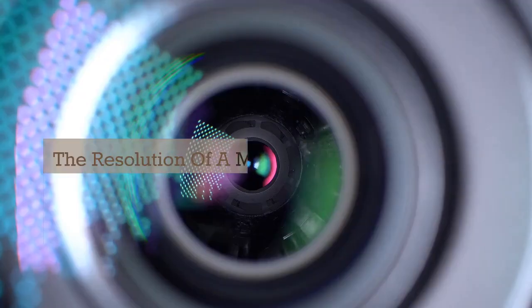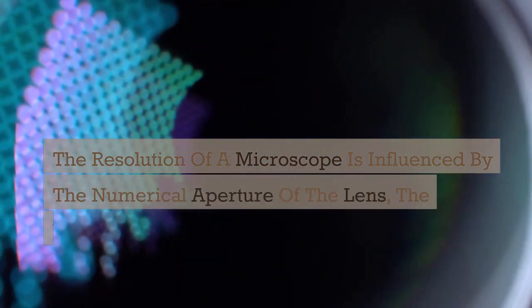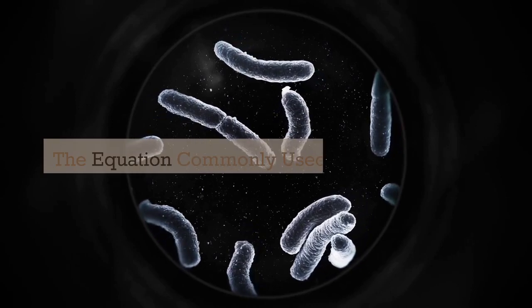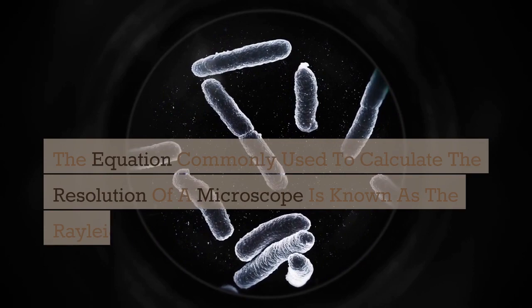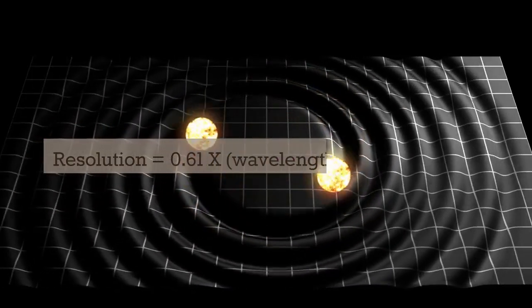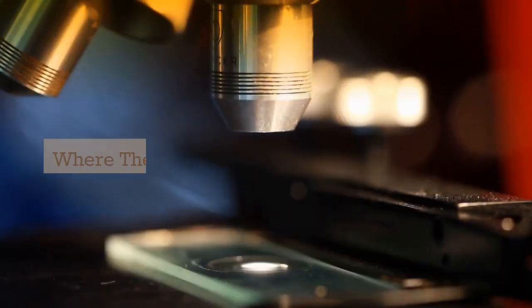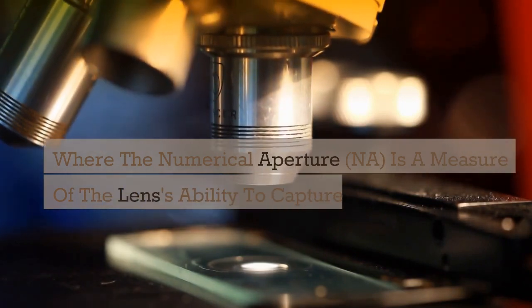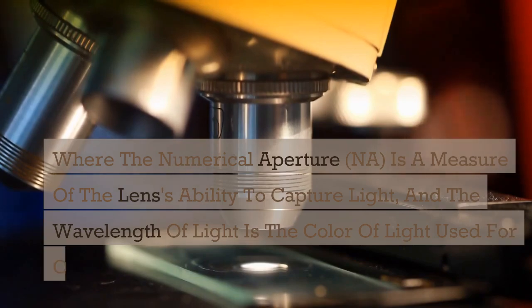The resolution of a microscope is influenced by the numerical aperture of the lens, the wavelength of light used, and other factors. The equation commonly used to calculate the resolution of a microscope is known as the Rayleigh criterion, which is resolution equals 0.61 times wavelength of light divided by numerical aperture, where the numerical aperture, NA, is a measure of the lens's ability to capture light, and the wavelength of light is the color of light used for observation.